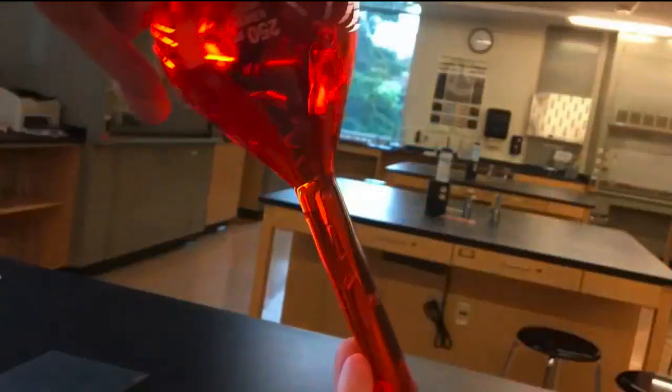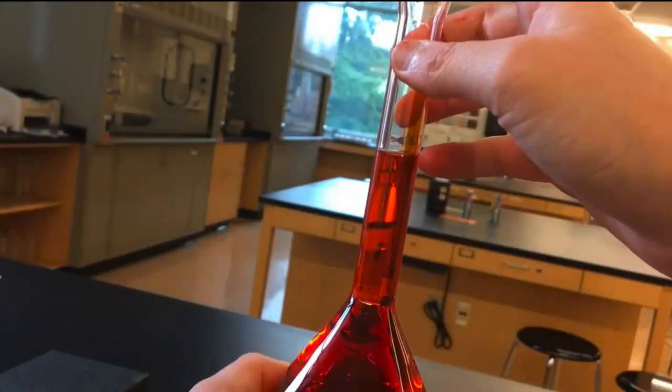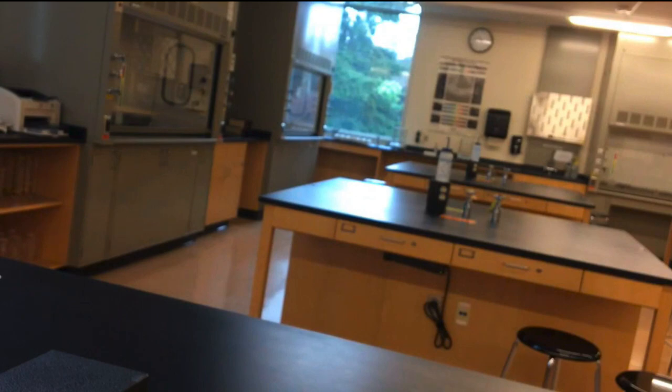Then we are going to swirl our solution a little bit just to make sure that it's all mixed together. Start tipping it. Look how unfocused the camera is. There we go. Now we've completed our stock solution.